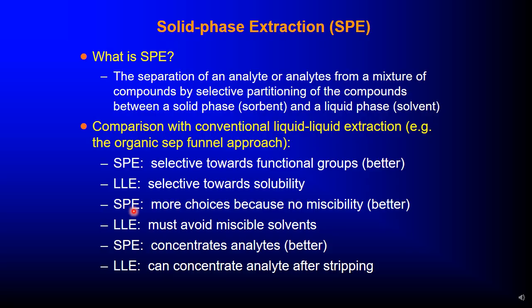Solid phase extraction has more choices because there is no miscibility issue, which is better. Liquid extraction must avoid miscible solvents. Solid phase extraction concentrates analytes, which is better. Liquid extraction can concentrate analyte after stripping.